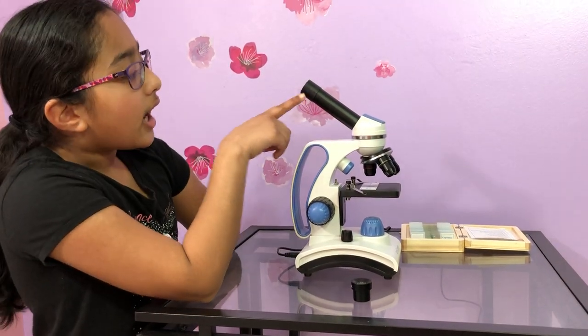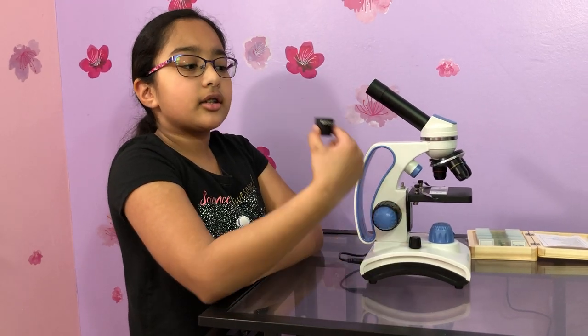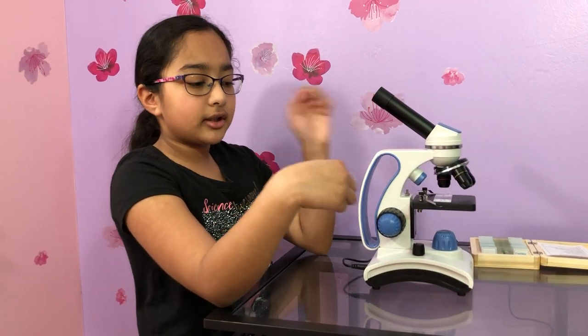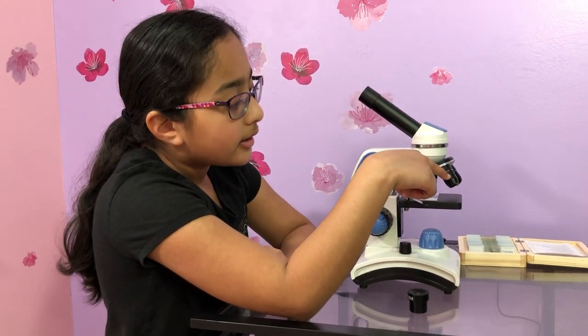This is the eyepiece and you'll look through here. I have two different eyepieces — this one is 25x and this one is 10x. And here is the objective lens.